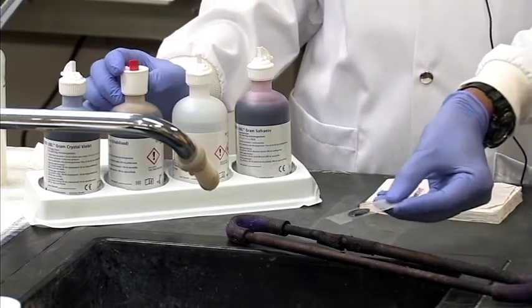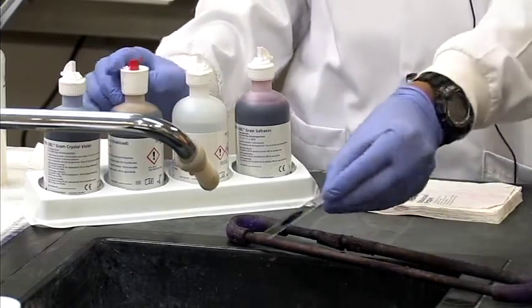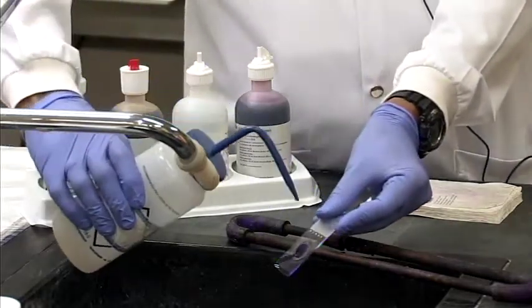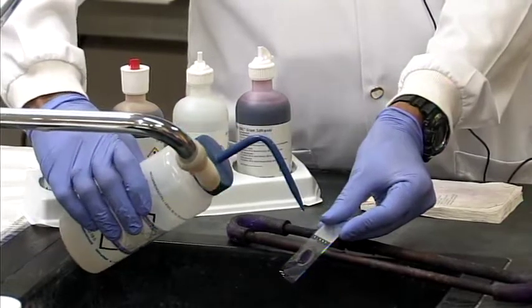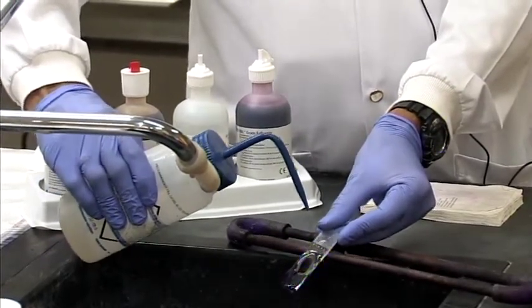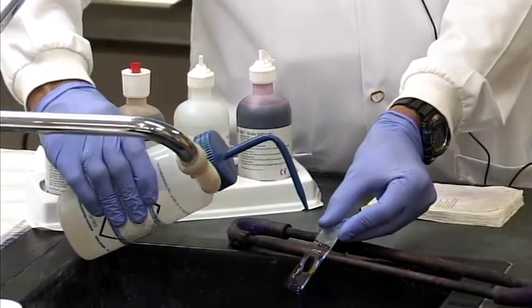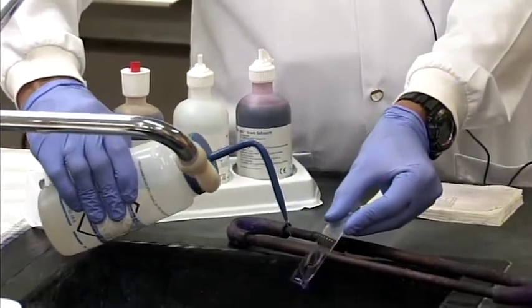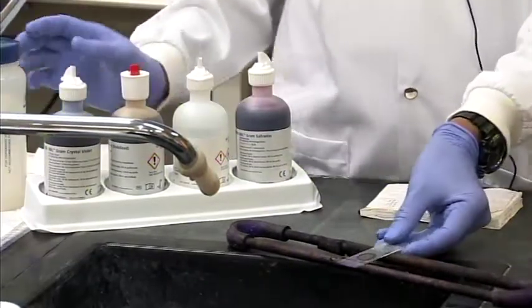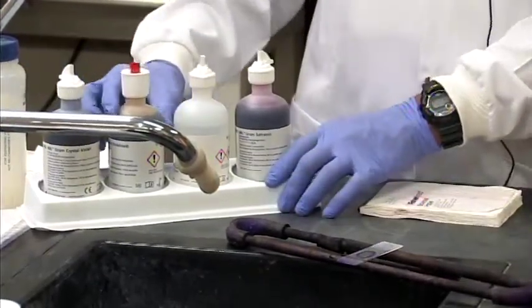We're going to decant now our stain into the sink or staining tray and simply rinse off with distilled water. Now when using distilled water, don't squirt on the smear itself. You squirt on the top of the smear slide, and the water will run down to wash off that excess stain. So you squirt around it, not on the smear itself. Shake off the excess. It doesn't have to be completely dried.